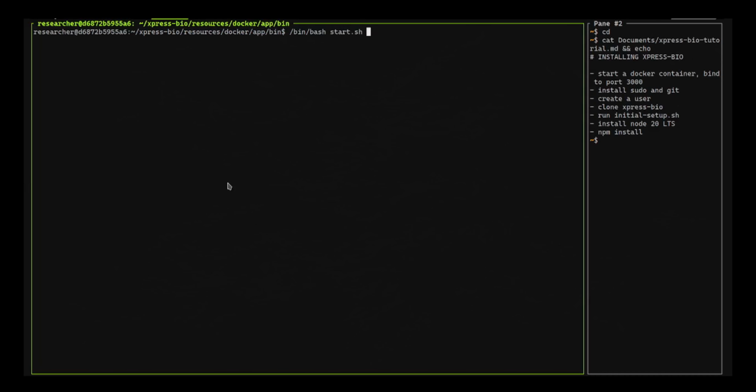In my case, I'm in a throwaway container, so I will pass an additional argument that signals the script to say, hey, don't make any assumptions about the environment that you're running in. I won't go into detail, but if you look inside the script, well, let's have a look.